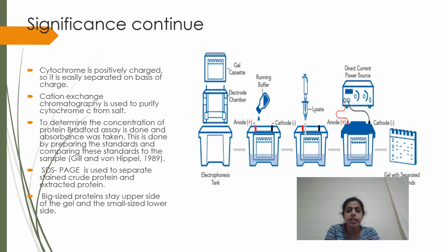Here we are using cation exchange chromatography, one type of ion exchange, which reversibly binds molecules to immobilized charged groups. So it is useful to separate macromolecules for purification purposes. Due to these properties, we are using cation exchange chromatography in the extraction of protein to purify the protein. It basically has four steps.